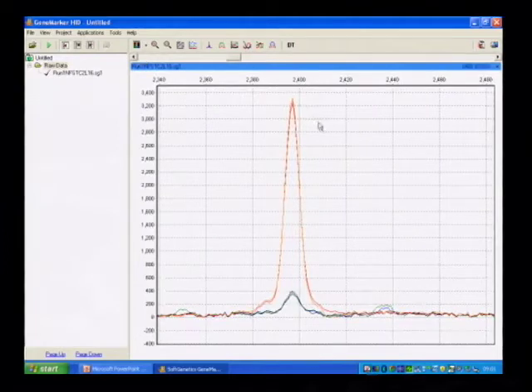And the orange peak, which is on the far side of the wavelength window, sees both only orange and red. It sees very little yellow, green, and blue, and we expect that because it's on the other side of the wavelength window. So I just wanted to show you that because the next thing I'm going to do is pull up a trace that has been corrected through software on GeneBench. So it takes the raw data now, it processes it so it's color corrected, and it moves it into GeneMarker.